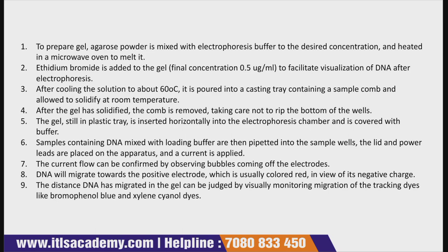Then it is inserted horizontally into the electrophoresis chamber, and you cover it with the buffer. The sample containing DNA is mixed with the loading buffer, and then pipetted into the sample well. The lid and the power leads are placed on the apparatus, and the current is applied.